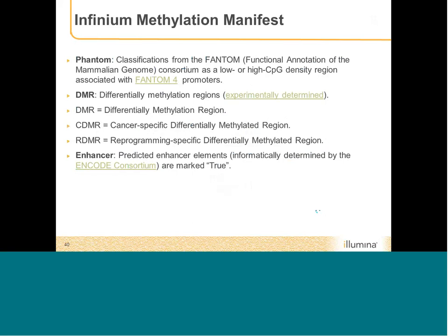All right. There are other columns in the methylation manifest which were contributed by a consortium of scientists for whom we designed this BeadChip initially, the Methylation Consortium. So a lot of this information was contributed by them. We don't have a lot of information outside of what they gave us. So we do have some of the columns listed here, and also some links out to the sources.